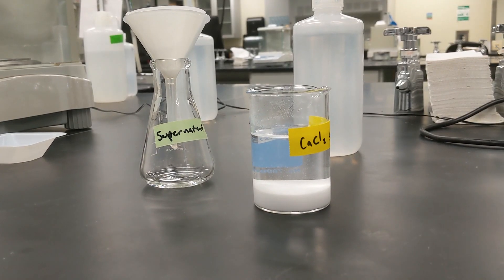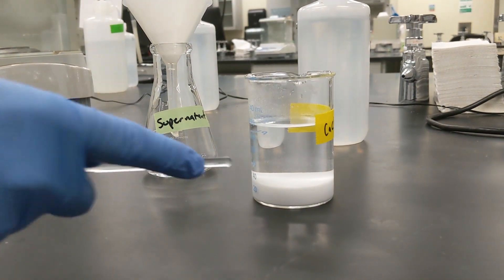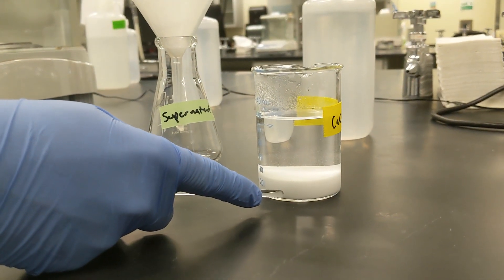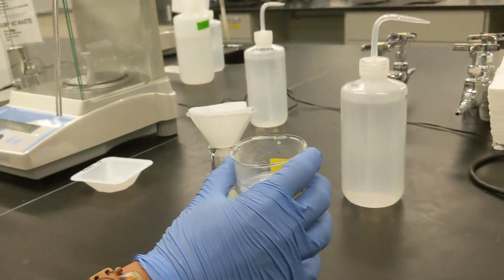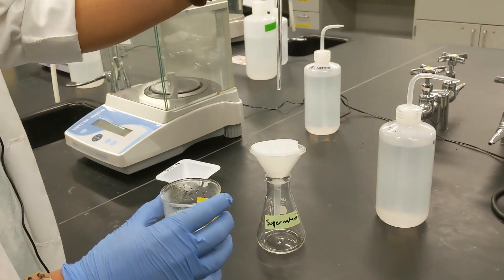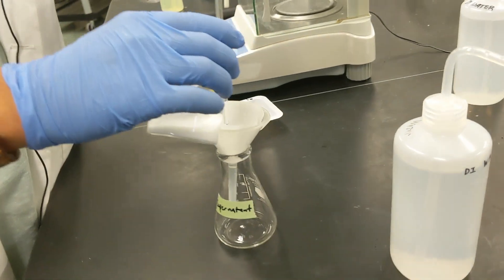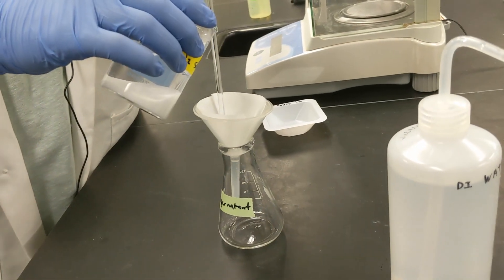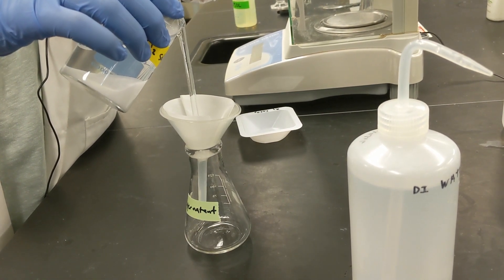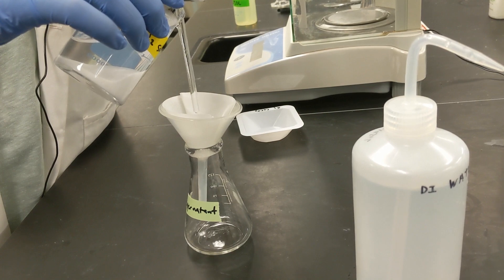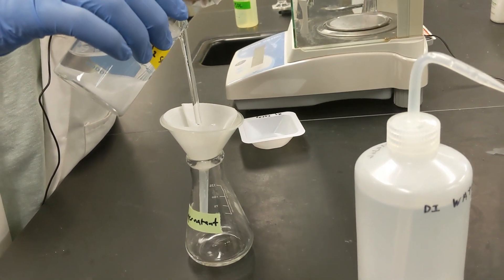So now we're going to filter our supernatant from our precipitant here. So you can see that they've formed two different layers. Our precipitant sitting at the bottom with the rest of our supernatant sitting at the top. So the way we're going to filter this is we're going to have this glass stir rod. We're going to carefully, without disturbing the solid, pour out some of the supernatant down the glass stir rod. So that way I'm not moving much of the solid that's sitting at the bottom of the beaker.